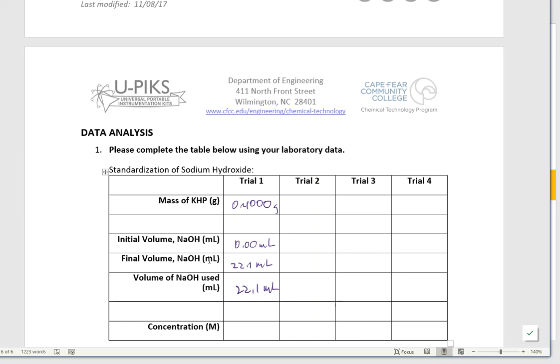And if your 4 trials do not work out, and if we're not very happy with the precision of the 4 trials, then folks, we'll make you go back and do it again. So make sure that you feel really comfortable with the process and the technique. Make sure that you give us good data. And if so, we'll check you out and you go home.